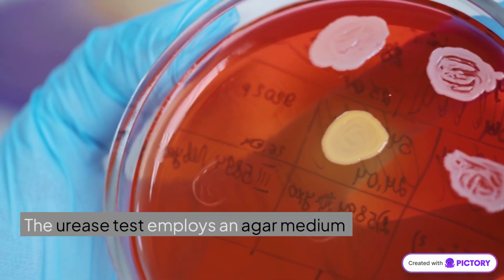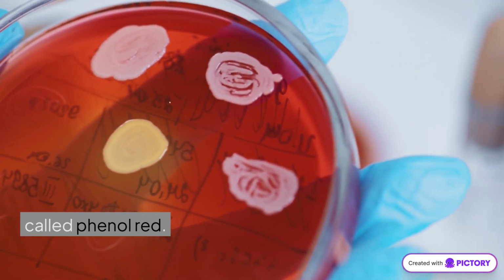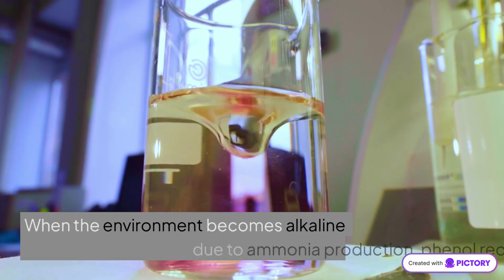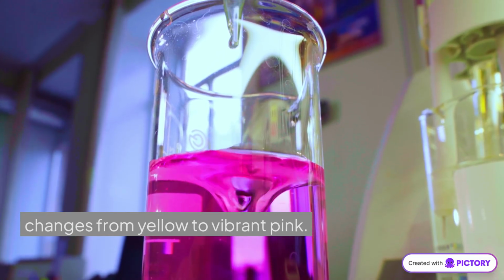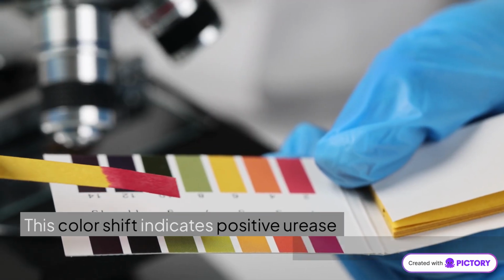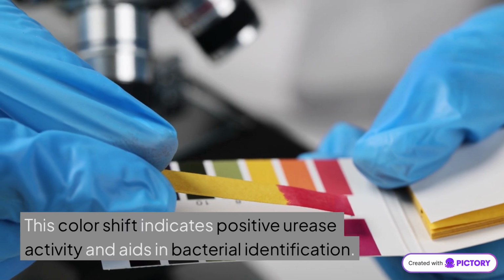The urease test employs an agar medium containing a color-changing indicator called phenol red. When the environment becomes alkaline due to ammonia production, phenol red changes from yellow to vibrant pink. This color shift indicates positive urease activity and aids in bacterial identification.